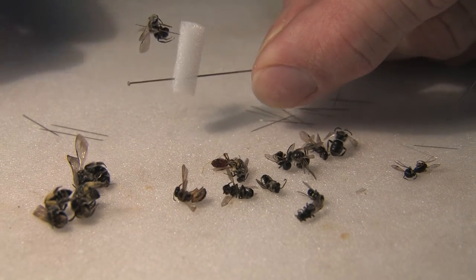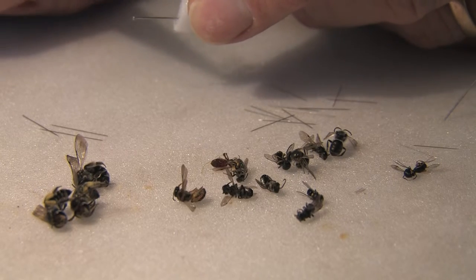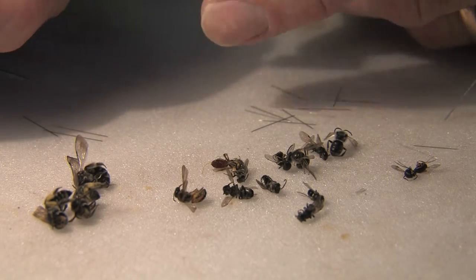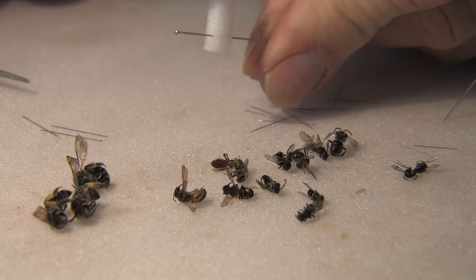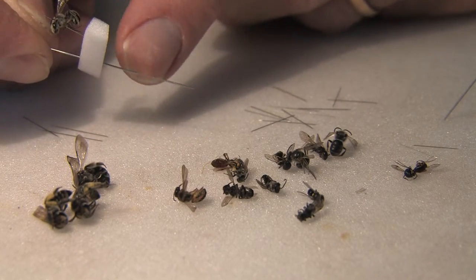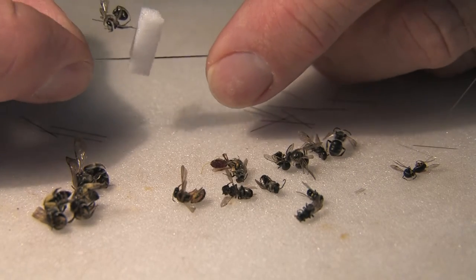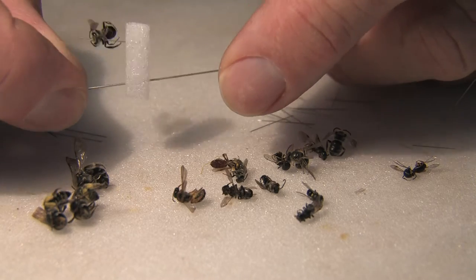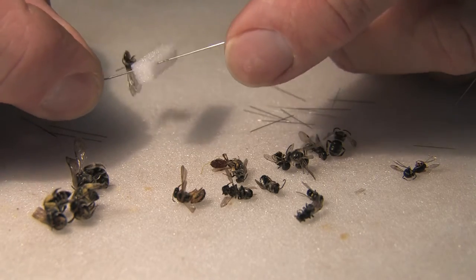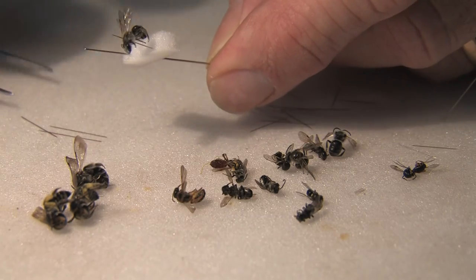This means you've got a specimen sitting upright, and if you wish you can have it staged the other way — it doesn't really matter. Allow yourself plenty of room down the bottom to put labels on, but the main thing is that you've got the specimen mounted. Under the microscope you can grab the pin and rotate the specimen around to see any part you wish.